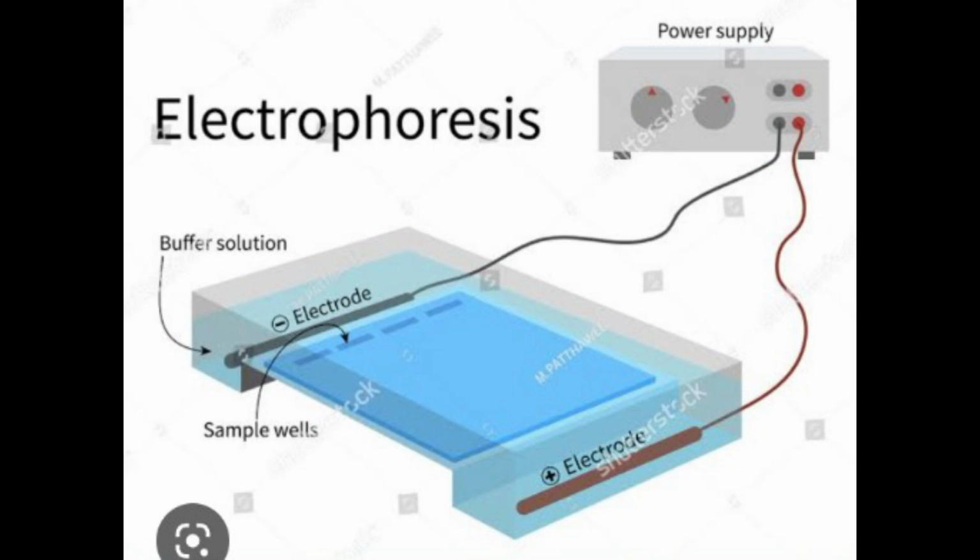Sample preparation: the sample may be any material containing proteins, for example prokaryotic or eukaryotic cells, tissue, viruses, environmental samples, or purified protein. In the case of solid tissue, these are often first broken down mechanically using a homogenizer, sonicator, or by cycling of high pressure. The cells may also be broken open by one of the above mechanical methods. In the case of tissue or cells, a combination of biochemical and mechanical techniques, including various types of filtration and centrifugation, may be used to separate different cell compartments and organelles prior to electrophoresis.